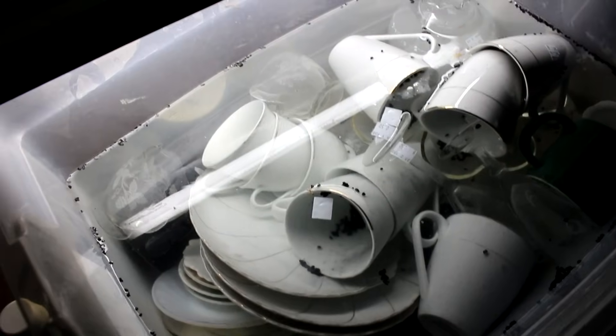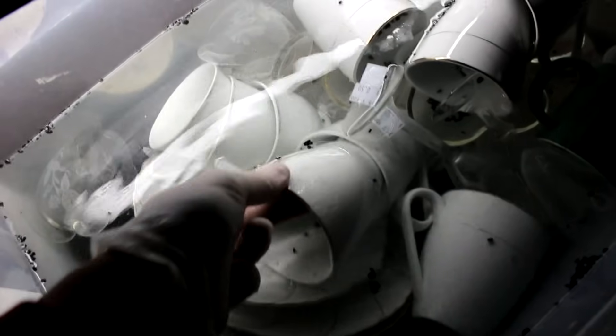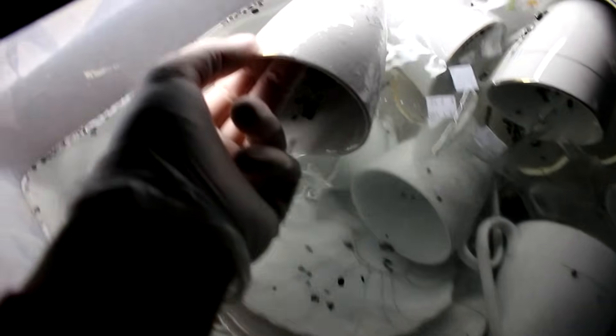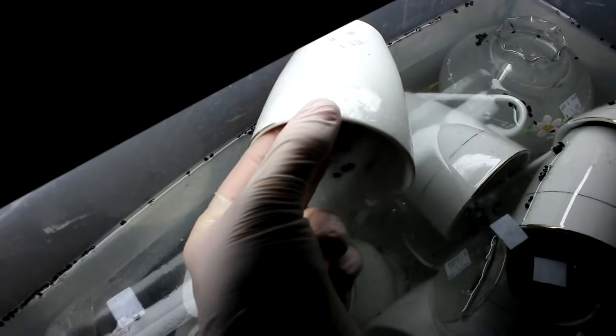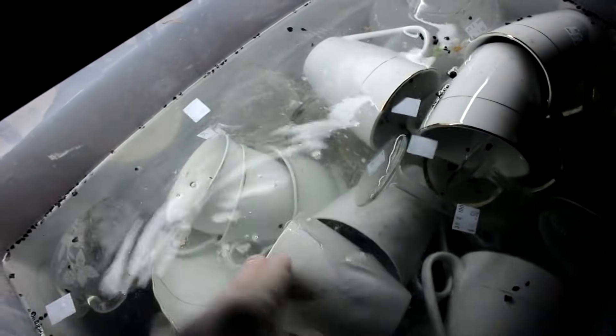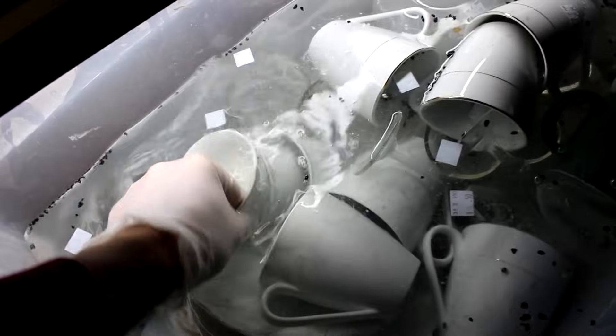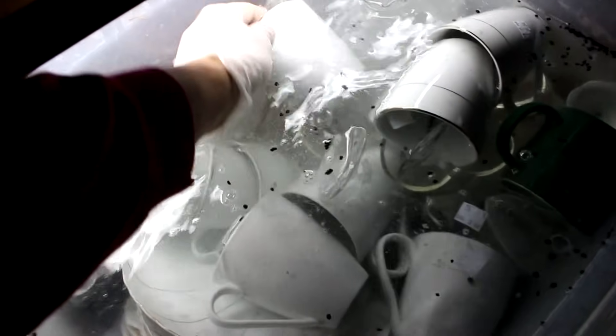So it's been a couple of hours — let's have a look and see how it's coming along. Bringing this cup over into the light, yeah, you can see that the solution is definitely dissolving the gold. That's good. I was kind of worried it would be too dilute, but looks like we're good. I'm just going to stir this around a little bit, turn over the cups so they can get the other side, and give everything a good mix. Then I'll just let it go for the rest of the night.